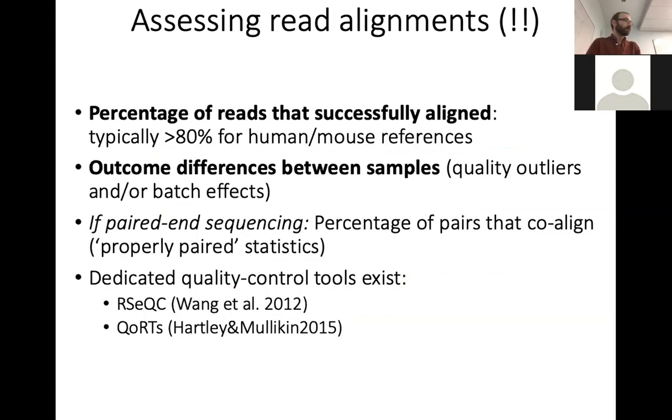So just to finish on these alignments, I'm going to go through a few other slides just to show you what the other things I wanted to talk about today. Yeah, they can see the slides. Okay, great. And then you're free to just try again, work on the alignments.